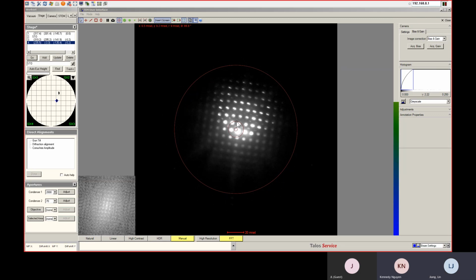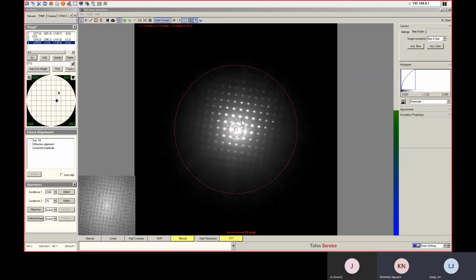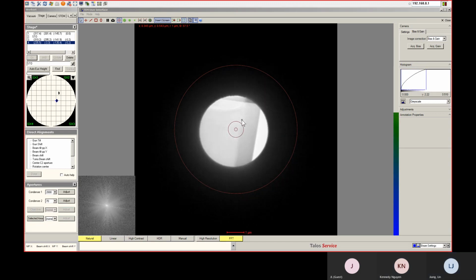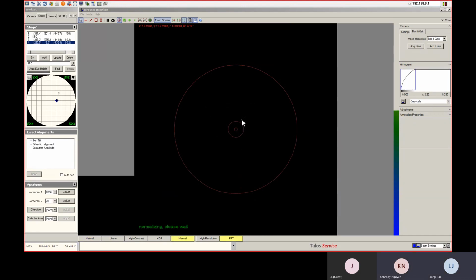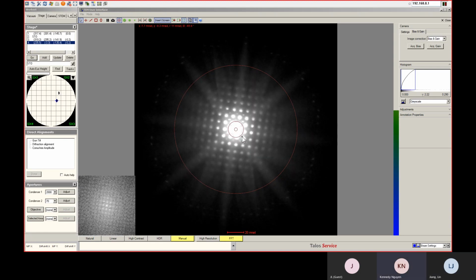Yeah, let's move up. Change location. So it's hard to tilt beta, so you have to keep updating your location. We were pretty close. Yeah, we're good. I think it's nearly the center.